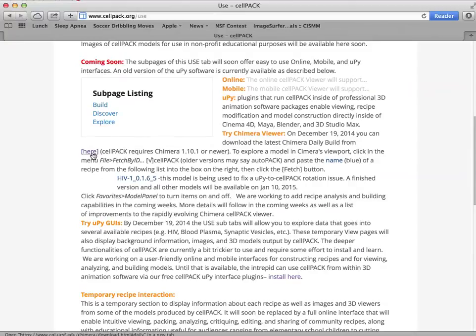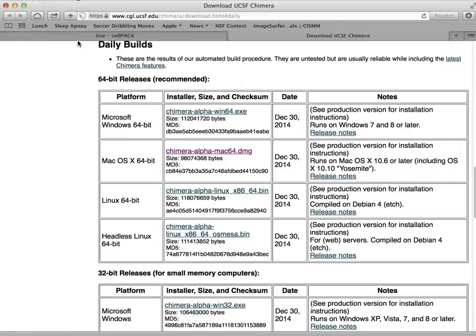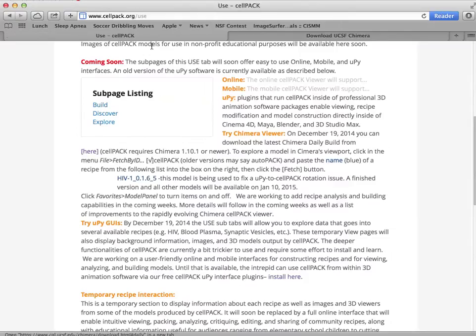You have to get the latest version of Chimera by clicking on the link here and going to find the correct daily build for the platform of your preference.